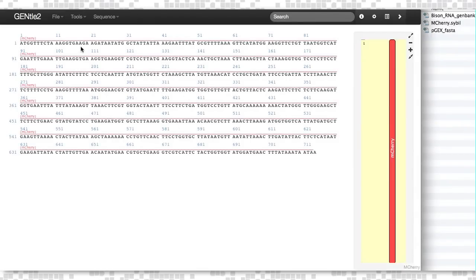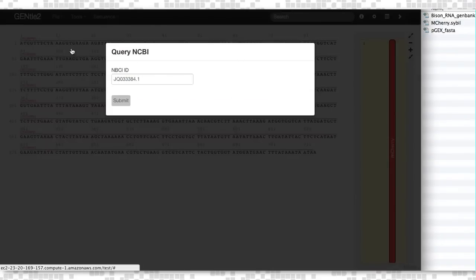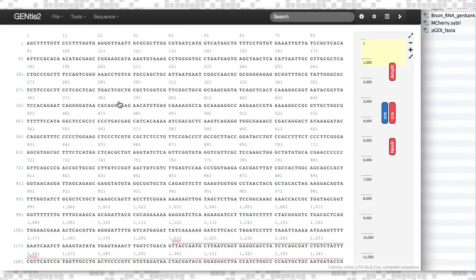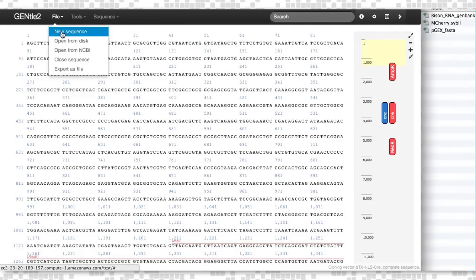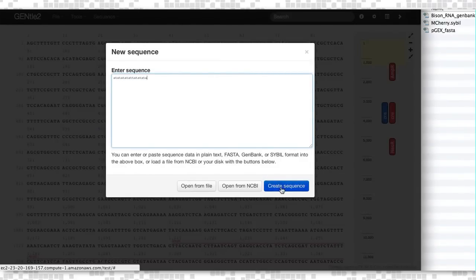You can also directly import via NCBI API, and you can also manually enter a new sequence using File > New Sequence, and manually enter your information here via copy and pasting.